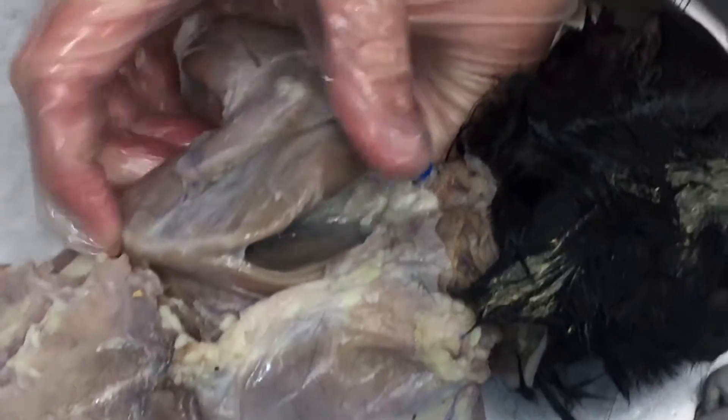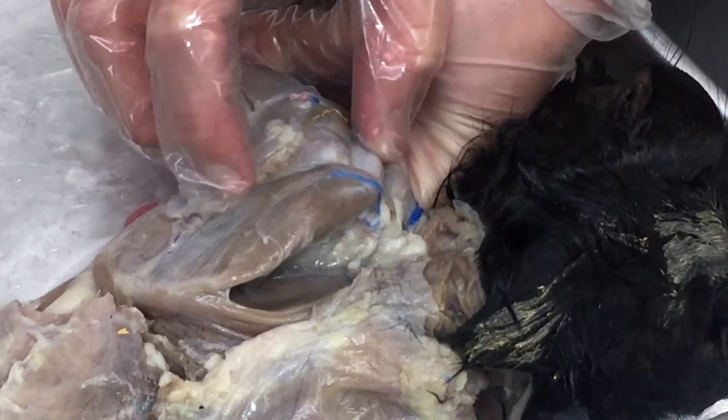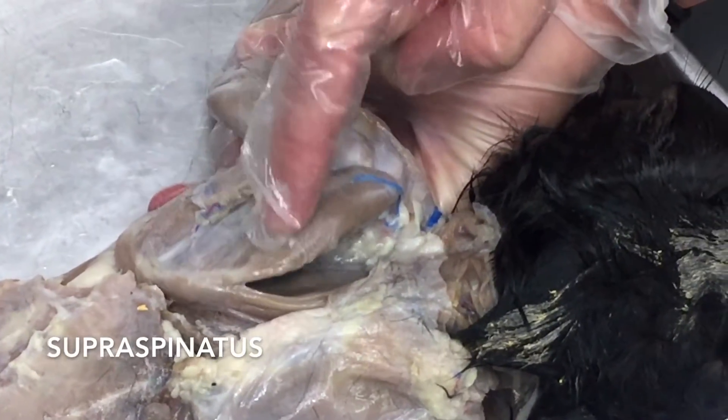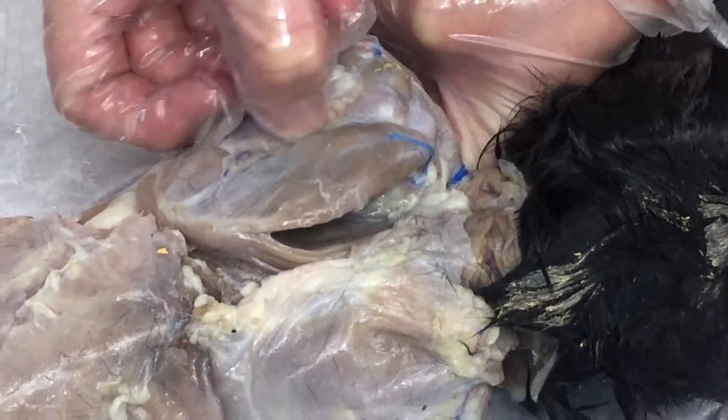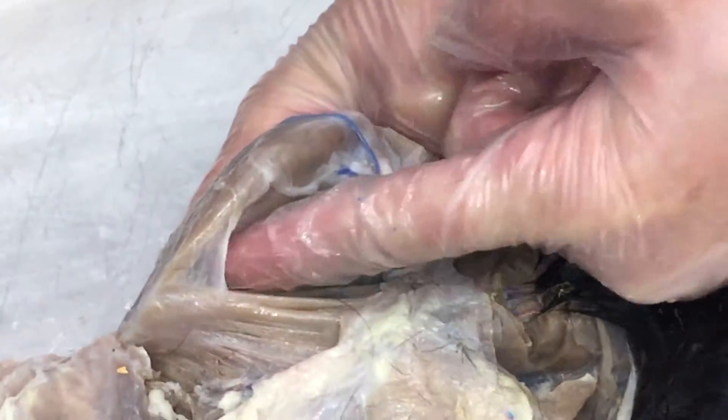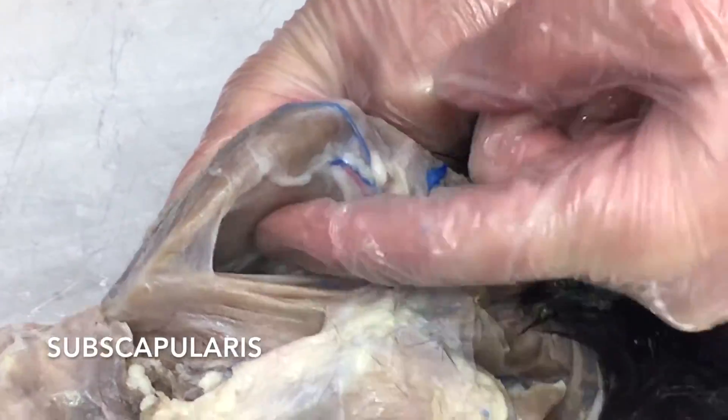On this side we've taken the trapezius off, so now we can see the deeper muscles underneath. This is the scapula, and this ridge of bone right here is the spine of the scapula. If you're above the ridge, above the spine, you're going to be the supraspinatus muscle. If you're below this spine of the scapula, you're going to be the infraspinatus muscle. The only other option is going under the scapula — the muscle on the underside will be the subscapularis muscle.